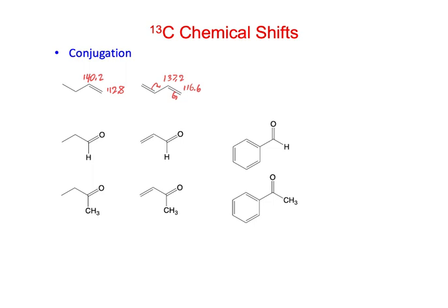I think they're more pronounced in these carbonyls, whether we have alpha, beta unsaturated or just normal carbonyls like this aldehyde, 201.5. Remember, aldehydes and ketones are usually 190 and above. But in fact, usually if there's no conjugation, it's 200 or above. And if there's conjugation, then it's a little bit more upfield. Basically, it's because this is partly so far downfield because of the delta plus on this carbon, but if you have a conjugated bond, then that bond can donate electron density to it and reduce the amount of delta plus on the carbonyl carbon. Just like if you have an ester or an amide, the non-bonding electrons can be pushed this way, and those are more upfield even than this, right?